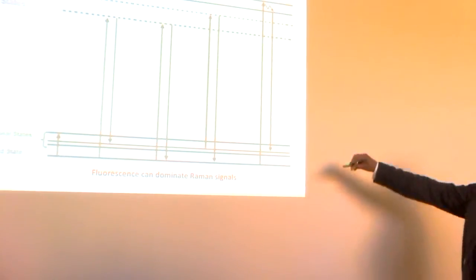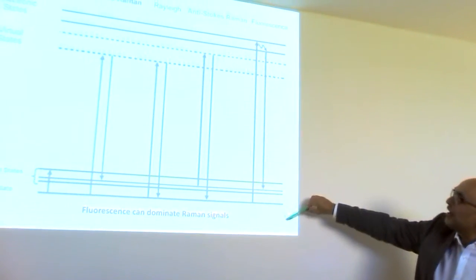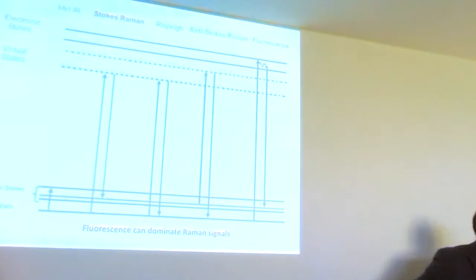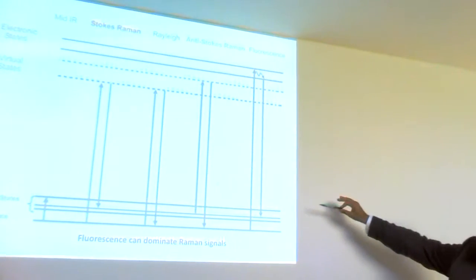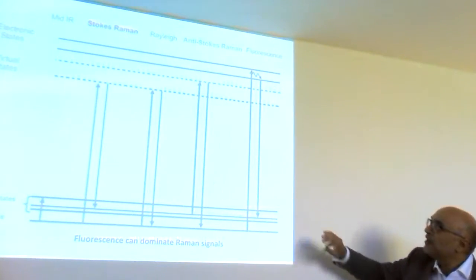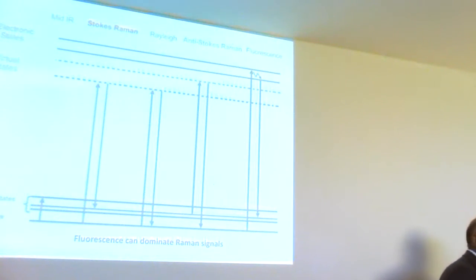It's really, in some ways, a quantum process like all of these. But the point is that you have normal fluorescence. So this is my Jablonski diagram. I have an excitation, and then I may have a fluorescence, if I'm exciting a fluorophore. But I also have the possibility of scattering up to a virtual step. So it's very quick. It's like an instantaneous kick.